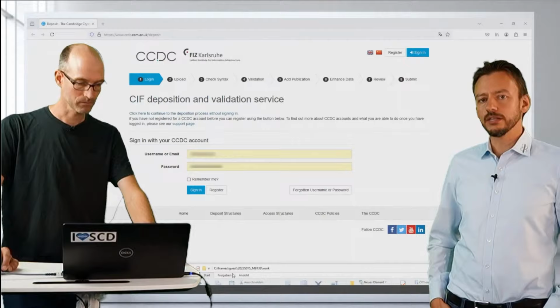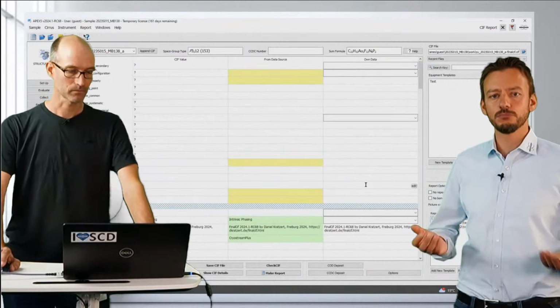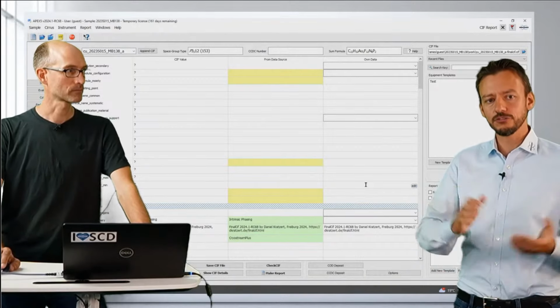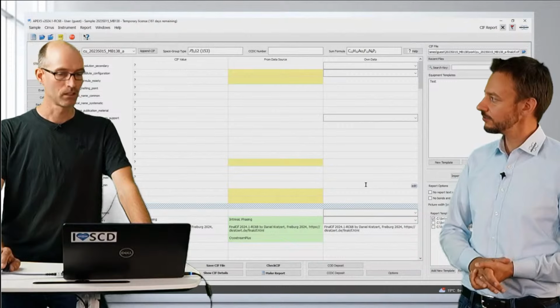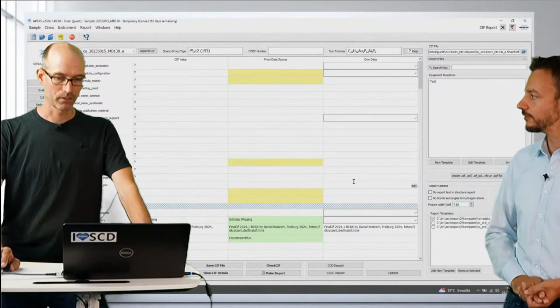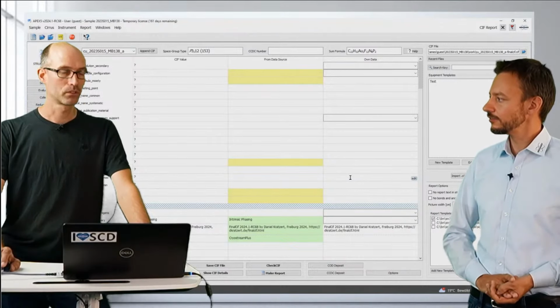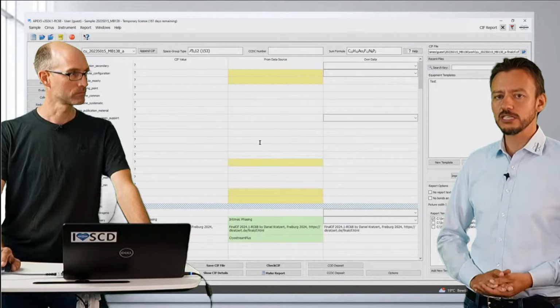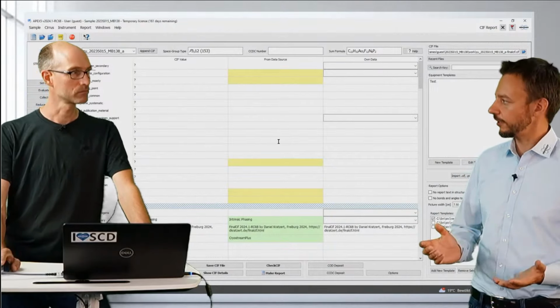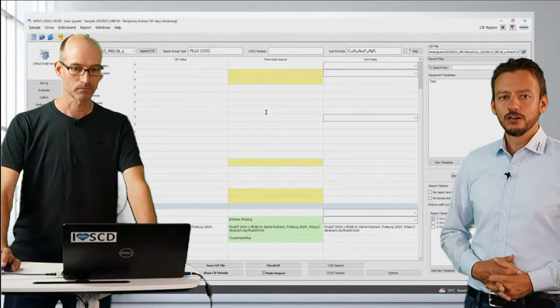Okay. Well, that looks like a very comprehensive tool to finish up the whole structure. I mean, after you went through that, is there anything left you need to do? Not really. After that, you have in hand what you need for publication. Okay, so that goes even beyond the functionality of FinalCif as a standalone at the moment. Yes, yes. Okay, great.